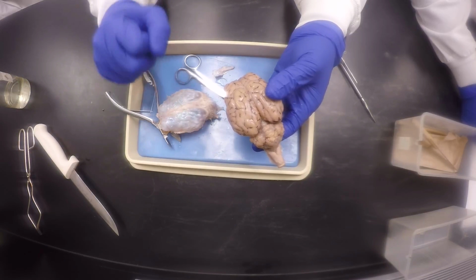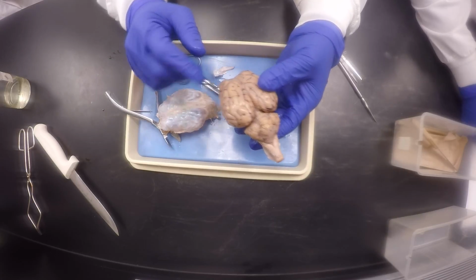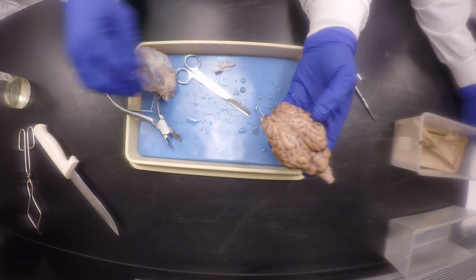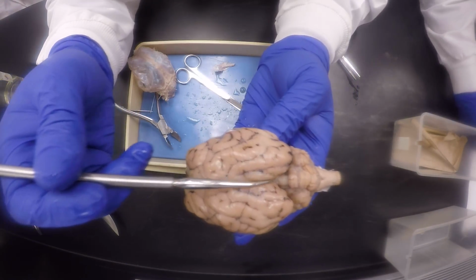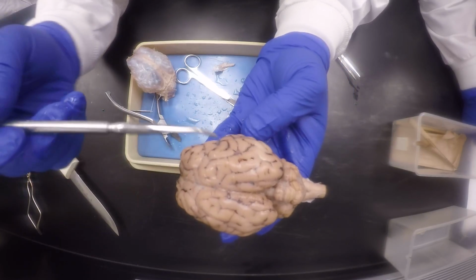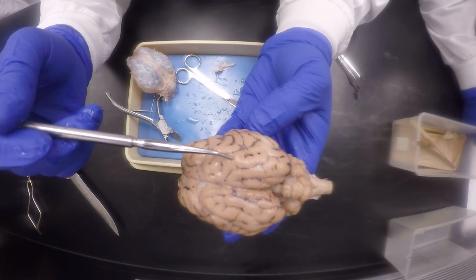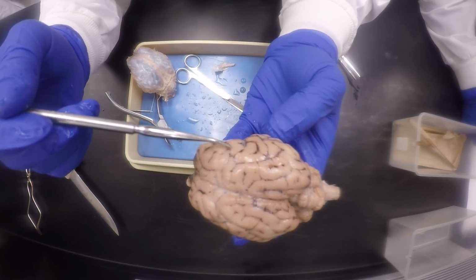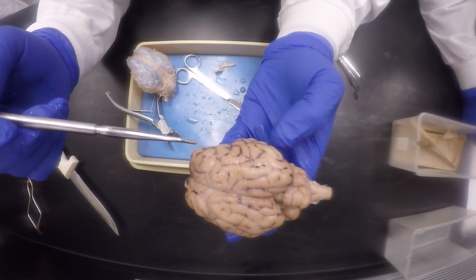The other ones remain attached to it, and the other one was the one I was peeling off of the brain, with the extensions of the pia mater. Okay, we are done with that. These are the other external structures. With my little probe, this is the longitudinal fissure or the cerebral fissure. These bumps, we call them the gyrus or gyri, plural. The lines are the sulcus, sulci, plural. We know about that already, so it's nothing new here.